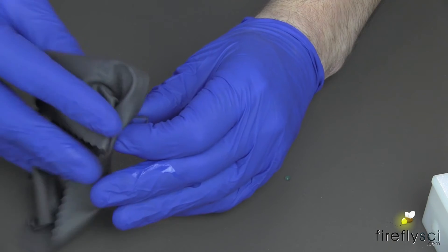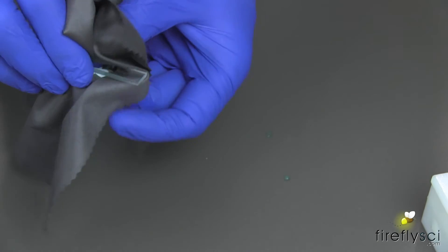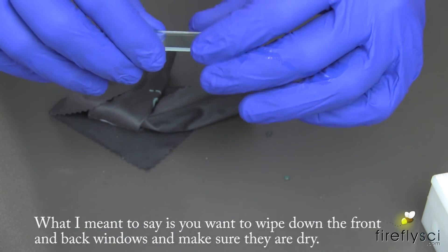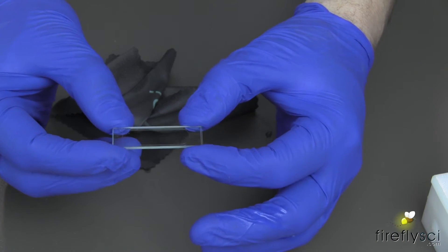Also make sure to dry any sample that may have overflowed. Give the cuvette a little squeeze, and then we have a perfectly loaded Type 20 cuvette.